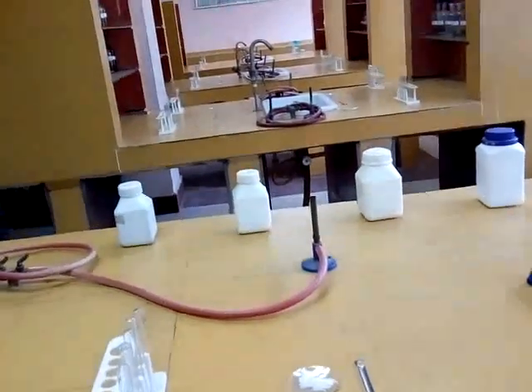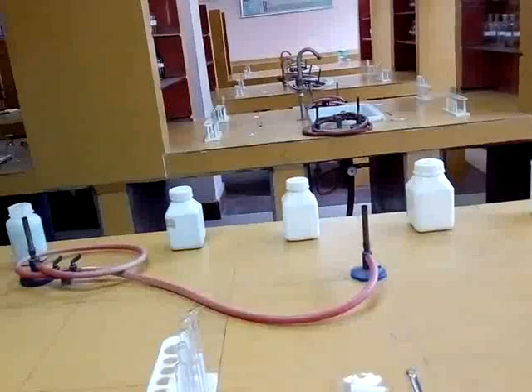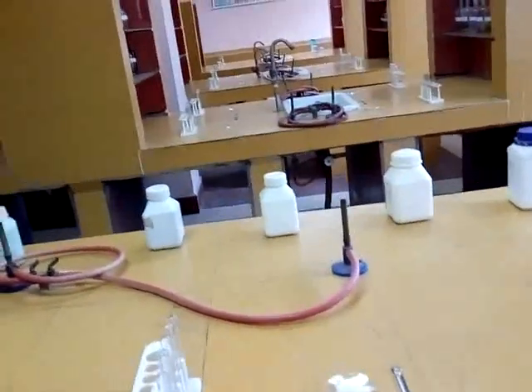So generally a salt consists of two radicals. One is acid radical and the other is basic radical. In salt analysis we need to identify the radicals only. Here I am giving you some examples of inorganic salts.